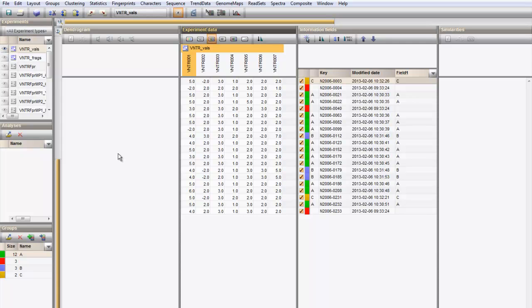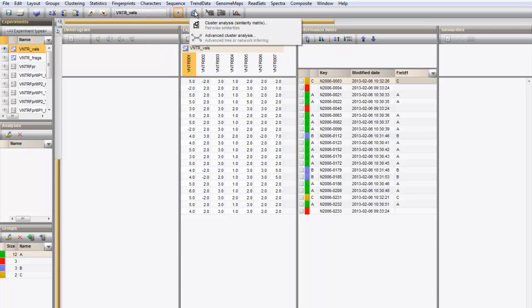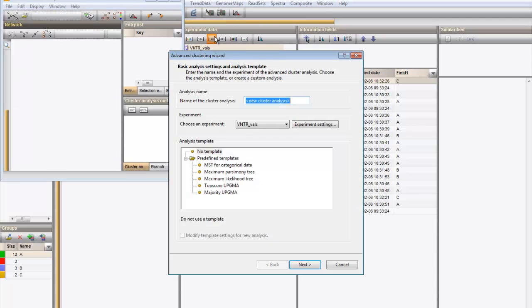The VNTR data in this character set can be analyzed in Bionumerics with all tools that are available for character data. Press the clustering button and choose Advanced cluster analysis.